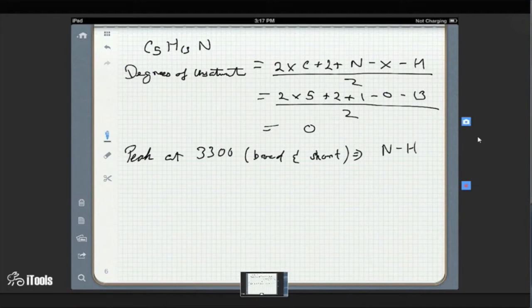And then this is 9H, so it's probably 3-methyl. Well, we should work away from the functional groups. Yeah, so we'll do NH there. Do we know if it's NH or NH2? The table just has NH here. Oh, no, it's NH2, because there's no 1H. There's no single hydrogen. Okay, yeah, then it'll have to be NH2.